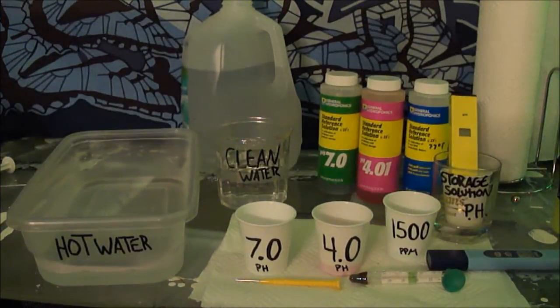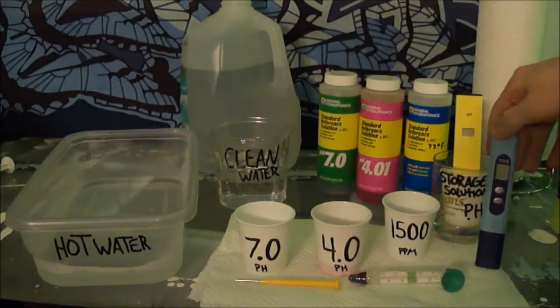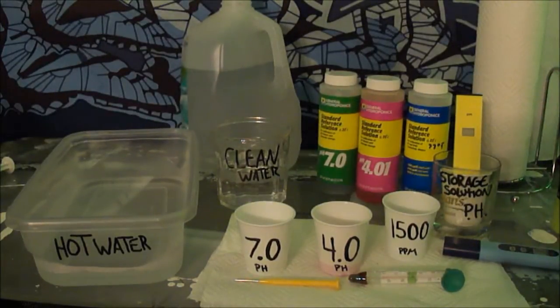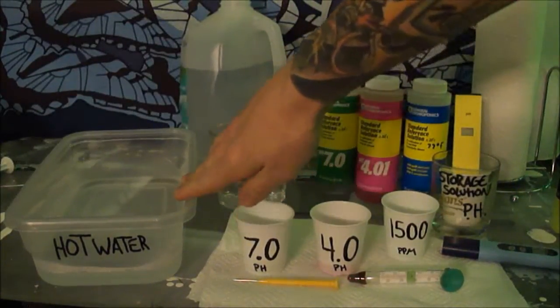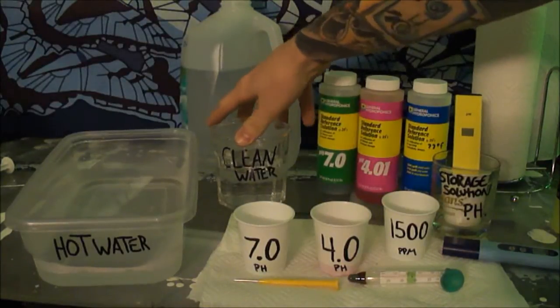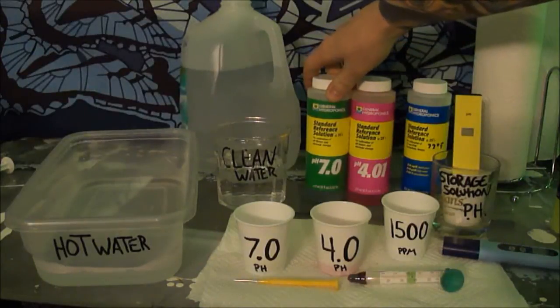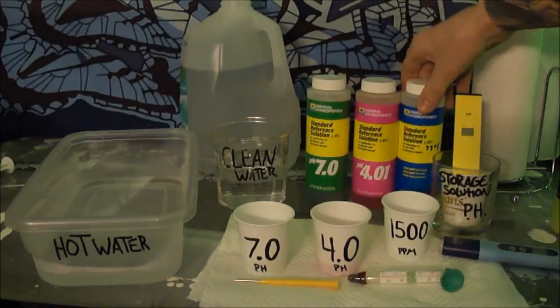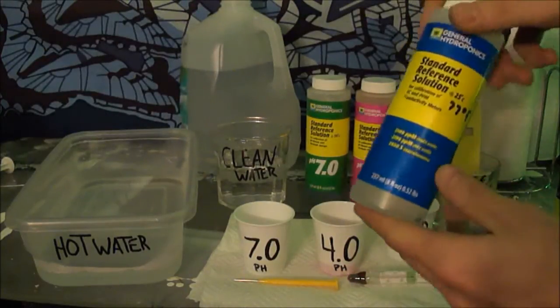I'm going to teach you how to calibrate your pH meter and your parts per million or total dissolved substances meter. This is really easy to do — the process is the same for both meters. All you need is some hot water, some clean purified water, and reference solution for your pH meter: 7.0 and 4.0.